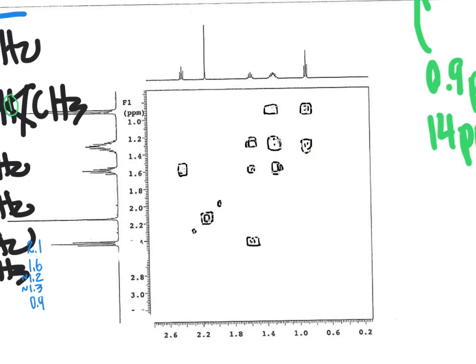And so as we look at that, and we think about candidates for what else is correlated there, coming across here, we don't really see anything. This signal seems a little bit further upfield, so that may or may not be a great option for something that's correlated with it.